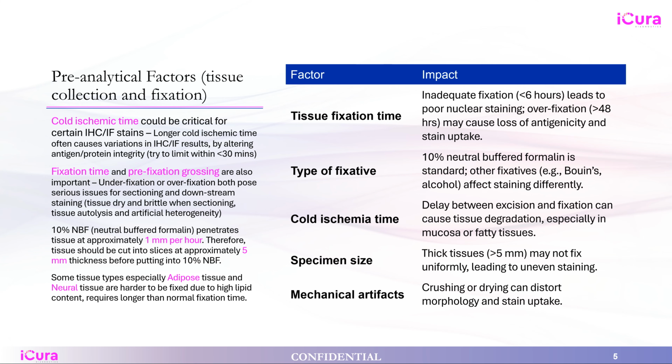Cold ischemic time essentially is the time period between when you take the tissue out of the living body, being a research animal or human subject, to the time point you put it into fixatives. And we recommend it to be less than 30 minutes. The reason being, when the tissue leaves the live body, it has the blood supply, nutrition, and everything cut off.